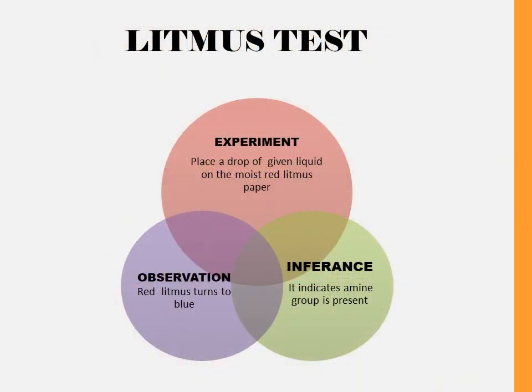The second test for amines is the litmus test. Place a drop of the given liquid or a pinch of the solid on moist red litmus paper and note the change in color. If the color changes to blue, it may be an amine.